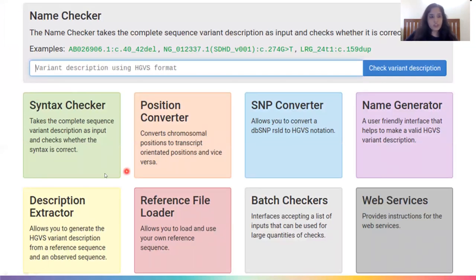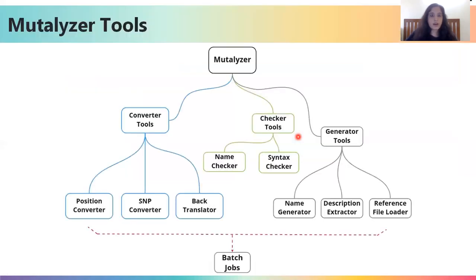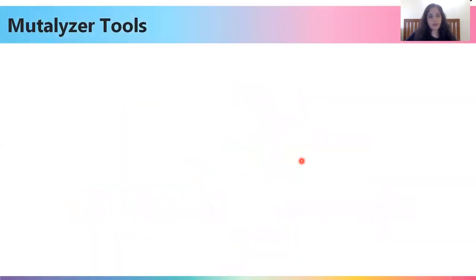Each box on the homepage is a single tool with a clickable interface. All tools are broadly classified into three main categories. The first is converter tools, which help us interconvert between different kinds of HGVS nomenclature. The second is checker tools, which help us check whether the syntax and the variant itself are correct. Third is generator tools, which help us generate variant descriptions in different input formats. Several of these tools can be utilized via batch jobs, which help us process several variants in the same go.